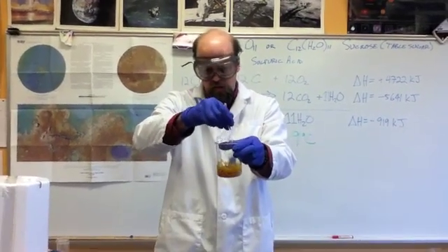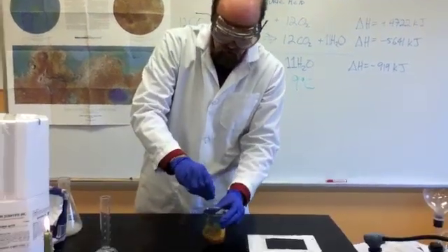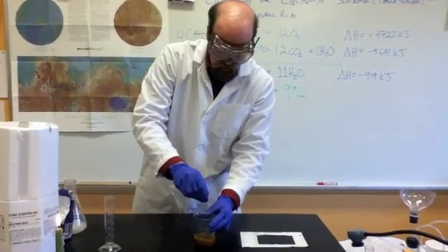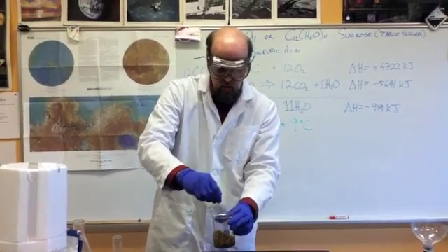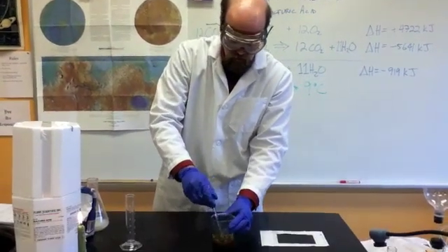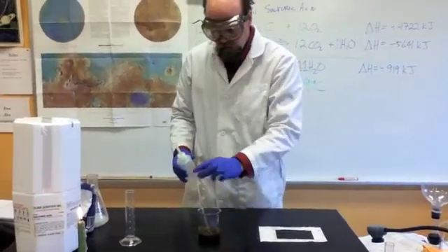You can already feel it getting warm. It's not really hot yet but it will be very hot in a moment. I'm going to let it turn nice and brown like this. There's black in the middle. Then I'm going to add a little bit of water to it to really get things going.